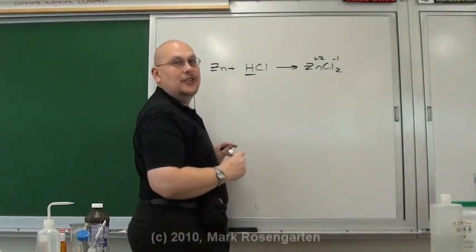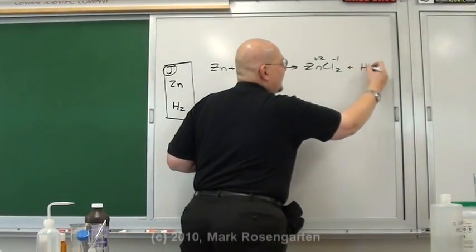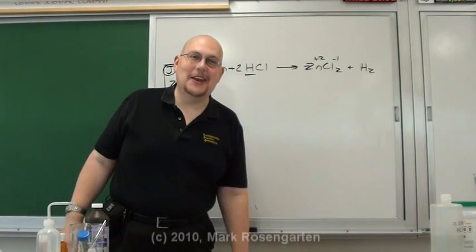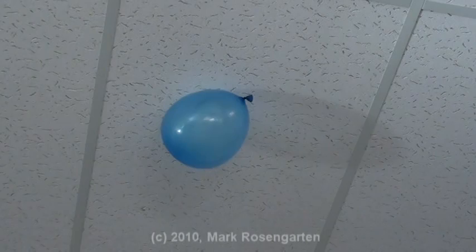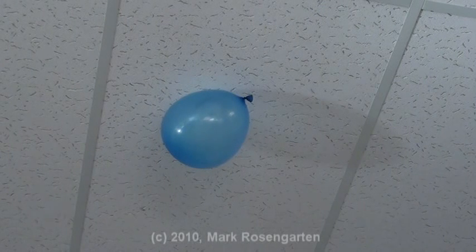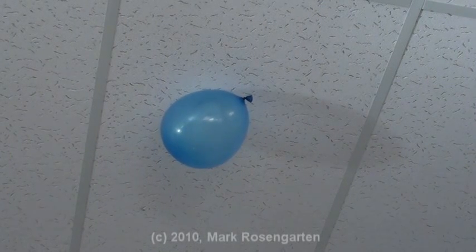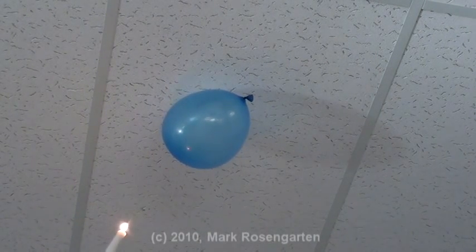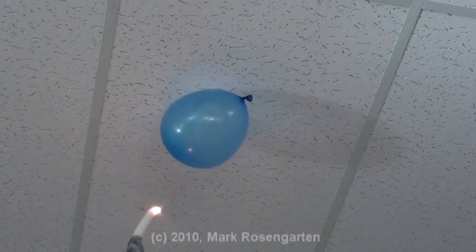And I'm going to prove to you it's hydrogen right now. I'm going to prove to you that this is not helium. Otherwise there would be a lot of crying babies all over the world. I'm going to introduce a flame to the balloon. Flame meet balloon.